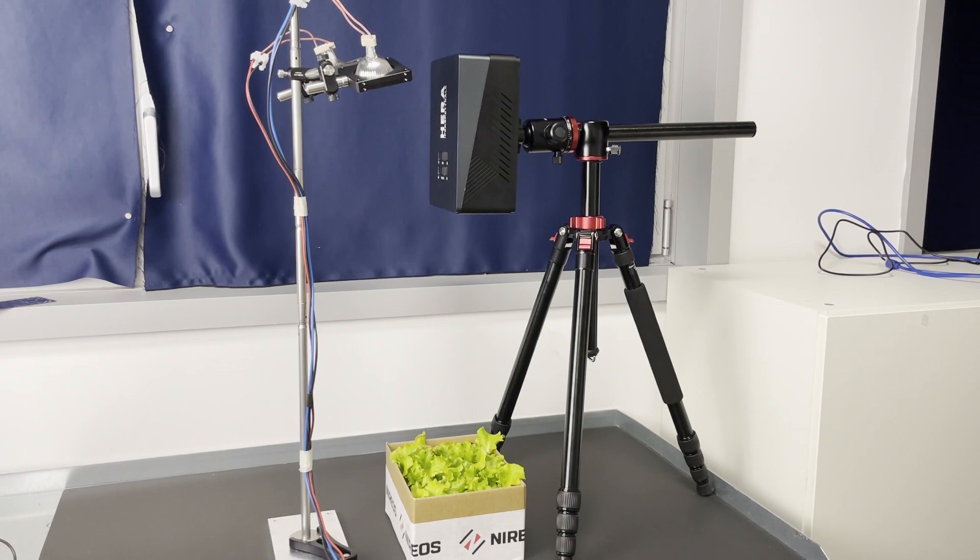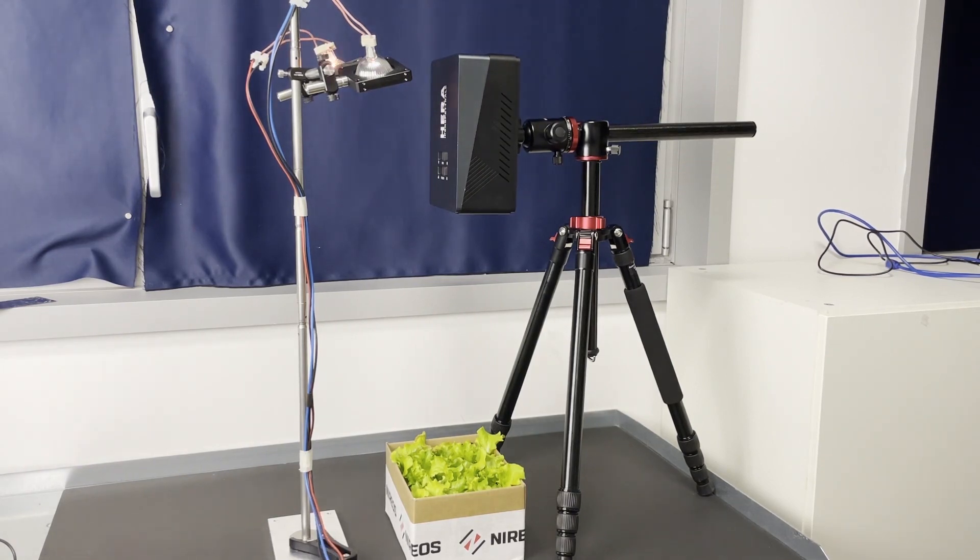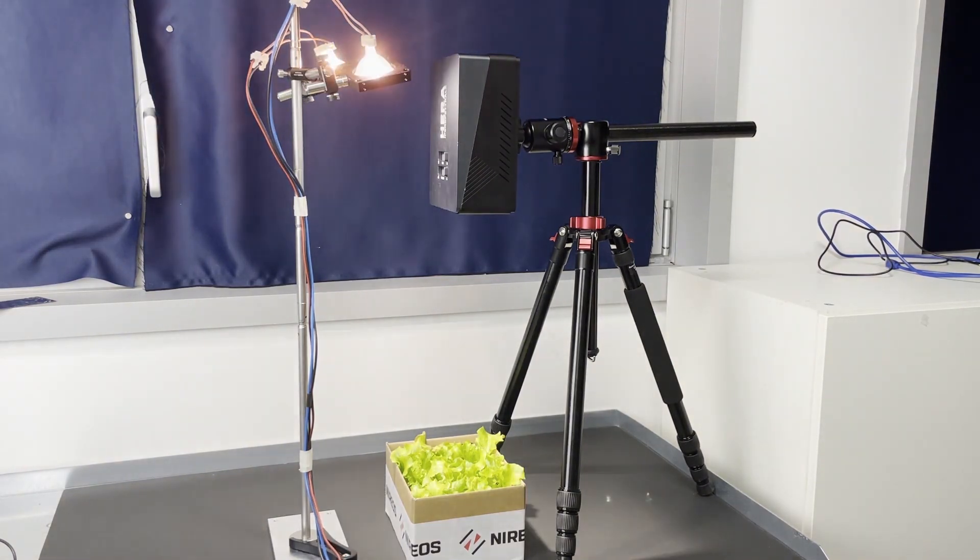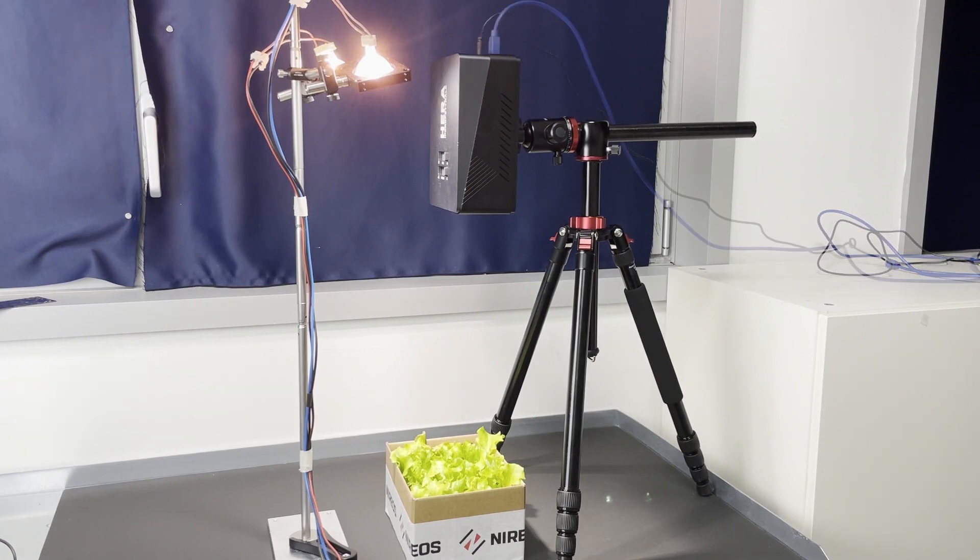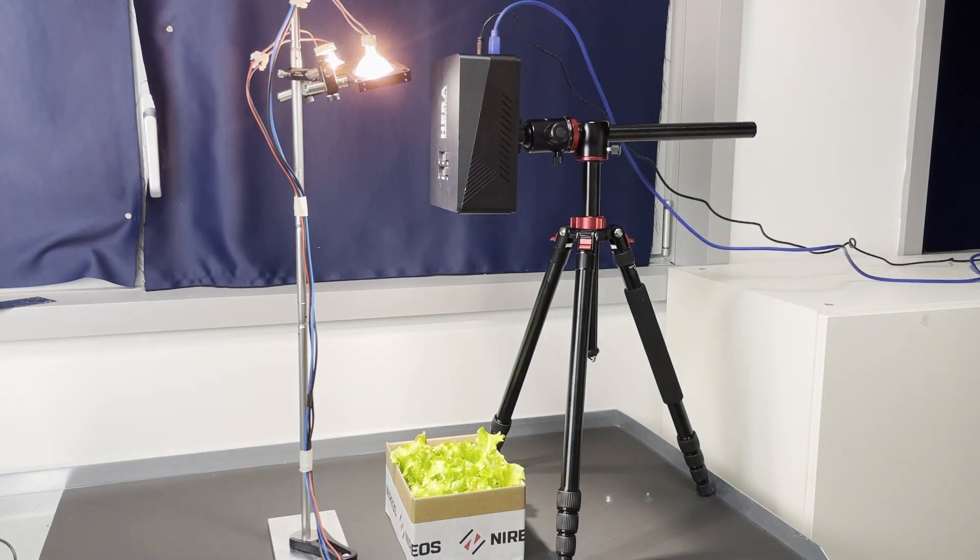In this case, as a sample, we have chosen salad leaves, and so we are going to measure the reflectance spectrum. Now everything is ready for the measurement.